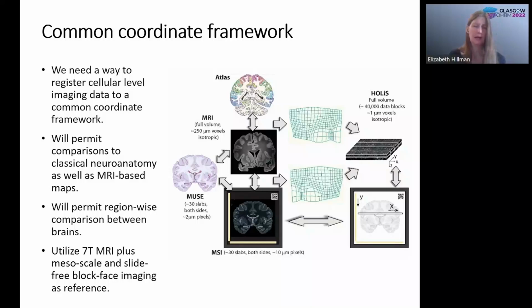And so we're working here with the team at Mount Sinai, Dr. Alan Seifert, looking at doing high field MRI on the ex vivo brains right after they have been fixated, and then working with Mike Miller's team at Johns Hopkins for doing these transformations between the different atlas spaces.